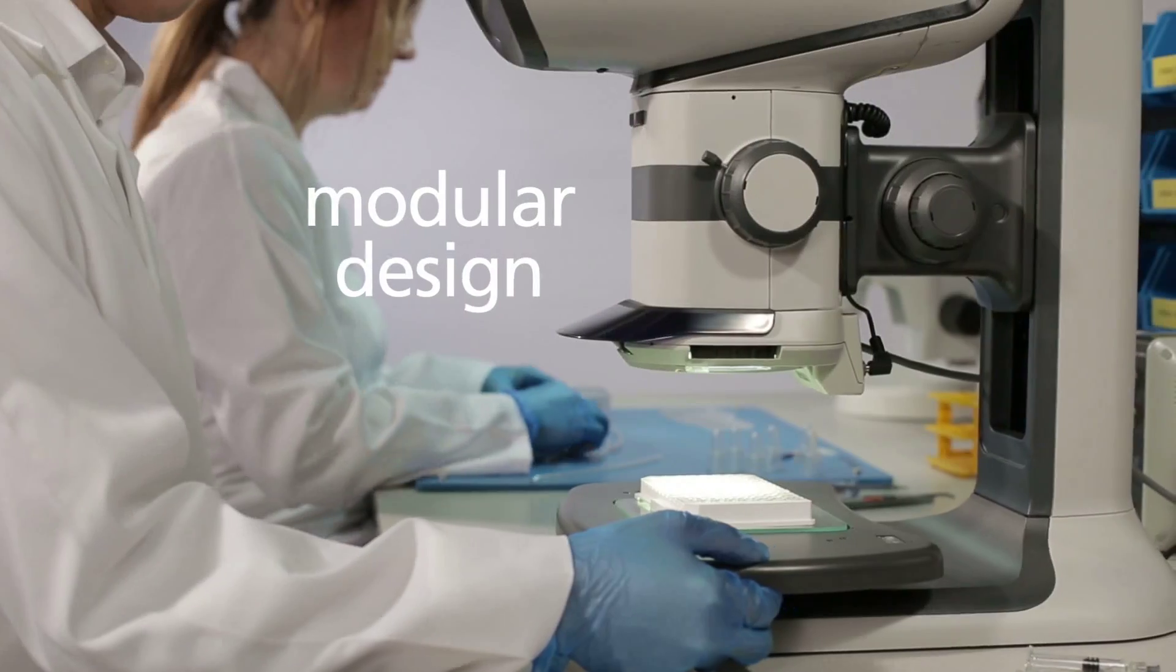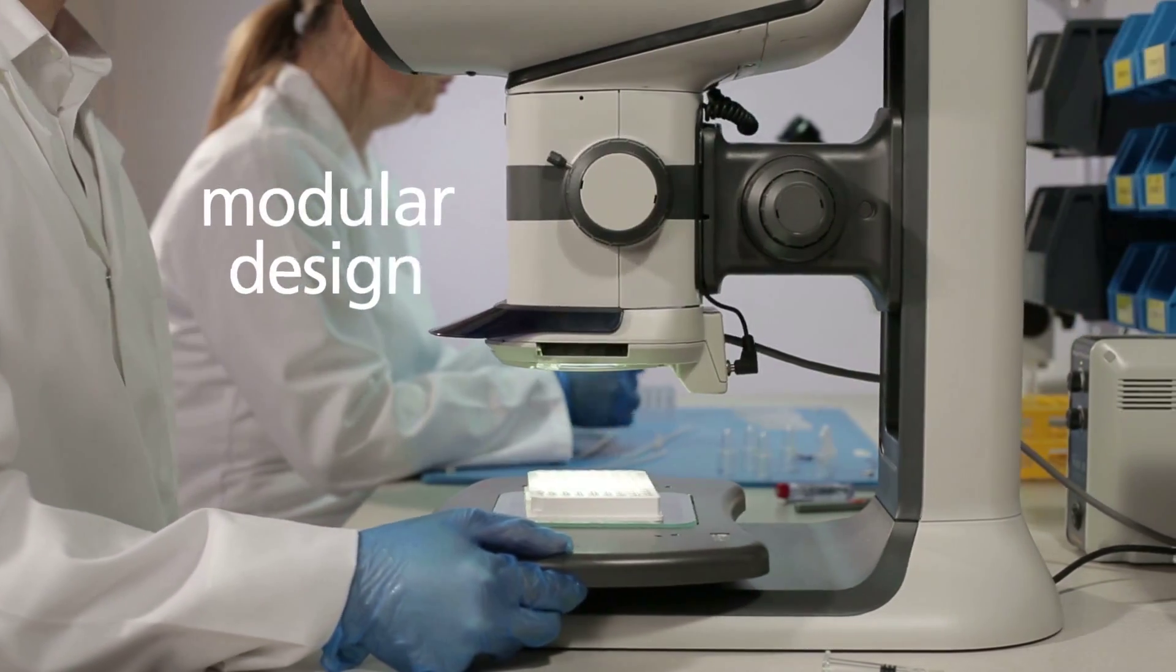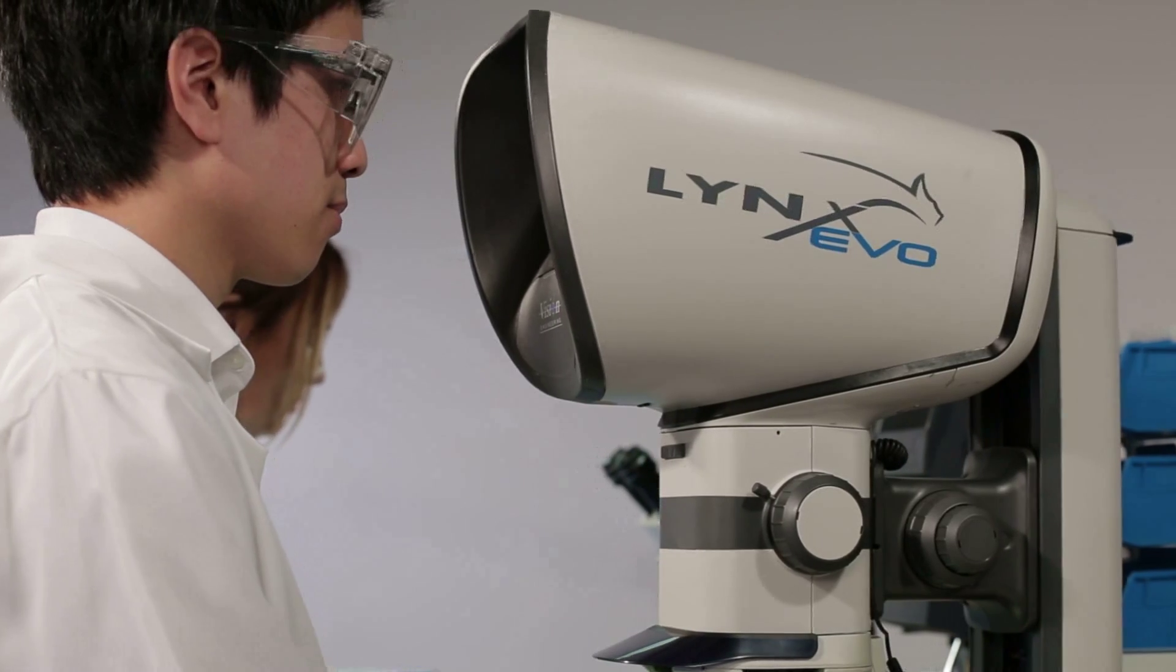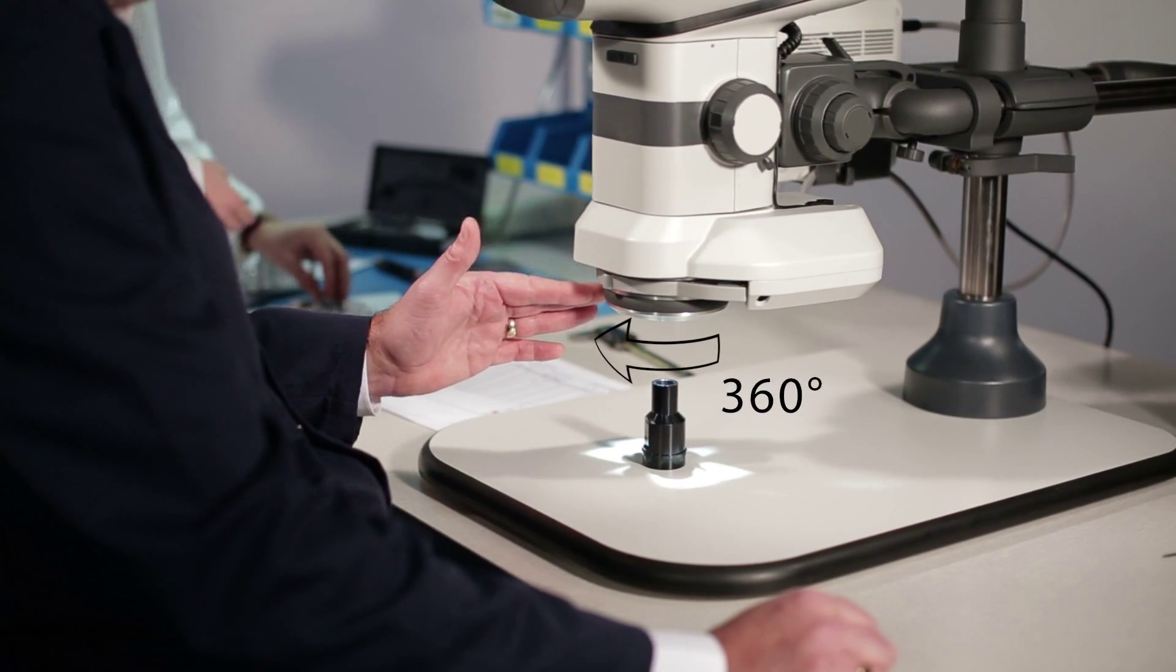Modular design allows Lynx Evo to be tailored to your requirements, with a range of magnification options, HD image capture, as well as the amazing 360-degree rotating viewer.